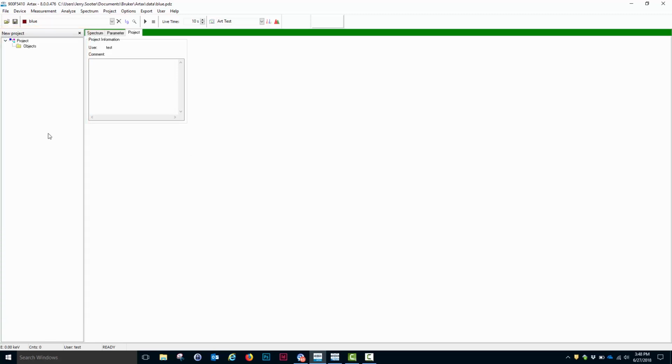The next thing I have to do is I have to add a node to this project. So I select Objects, go back to the project icon, and click Add Node. In this case, I want to call the node Points.